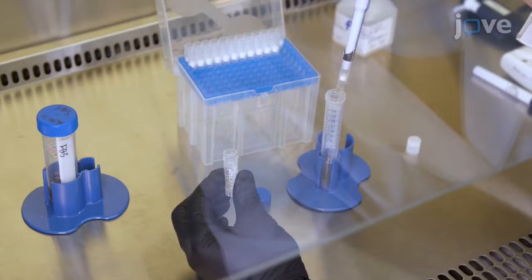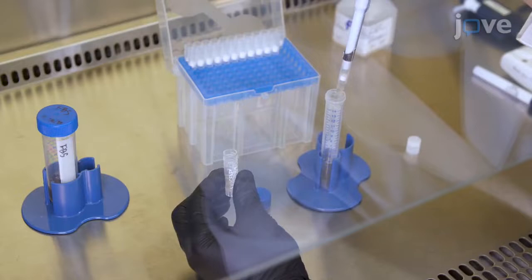Gently pipette to resuspend the sample and transfer the whole volume dropwise into a conical tube containing 2 milliliters of pre-warmed FBS.